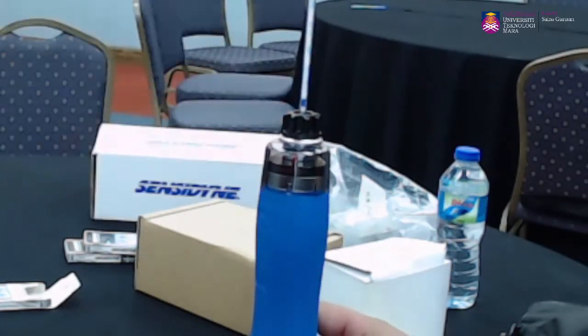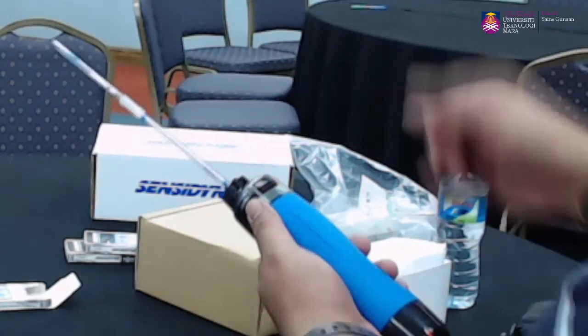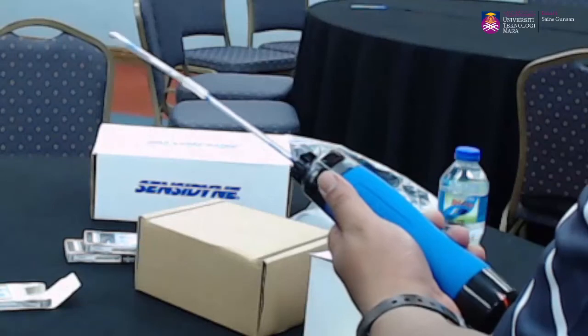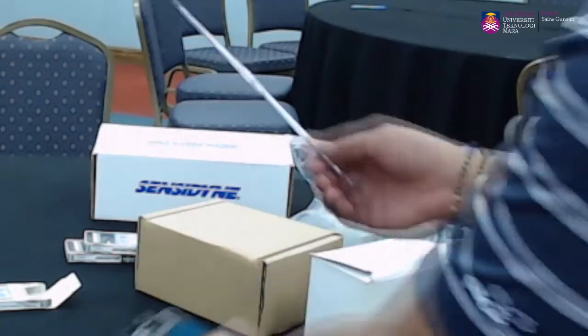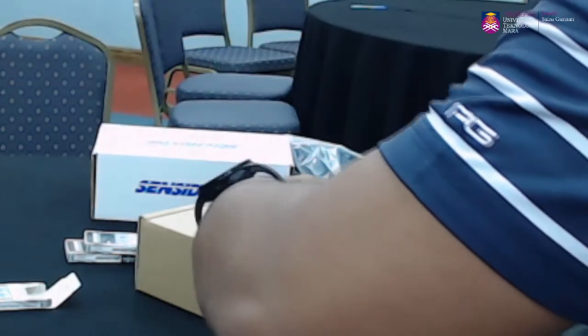Okay. Nampak dah. Okay, so daripada situ once kita dah complete lah 3 strokes as per dia punya instruction, tutup balik. Kita just tolak balik ke dalam. Then kita just cabut. Okay. So daripada situ kita ambil reading dekat kita punya this tube.